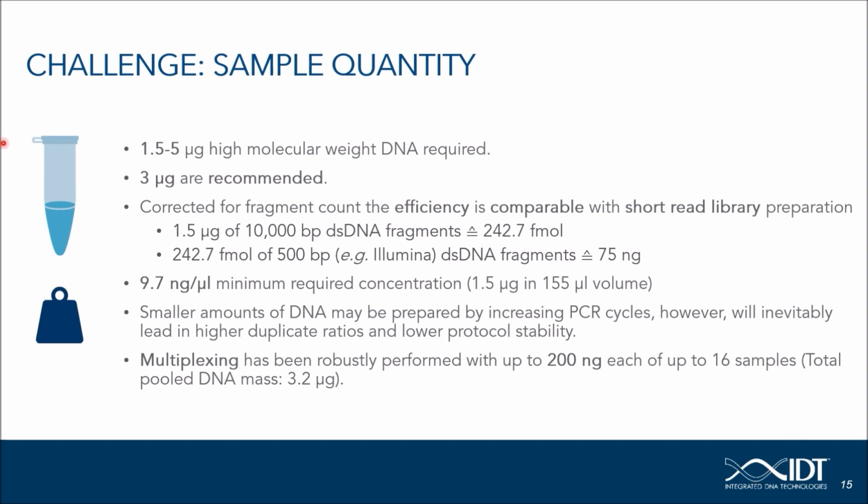The second challenge is sample quantity. Our protocol works in a range of 1.5 to 5 micrograms of high molecular weight DNA input. However, in order to account for sample differences, as well as applying a safety margin, we would recommend you to use 3 micrograms of input DNA.